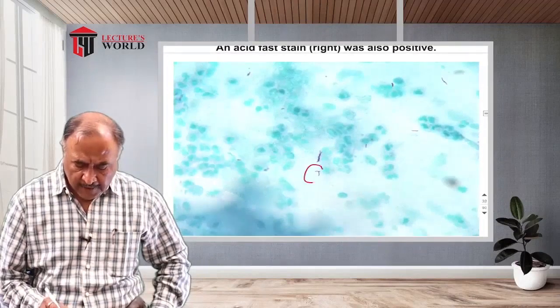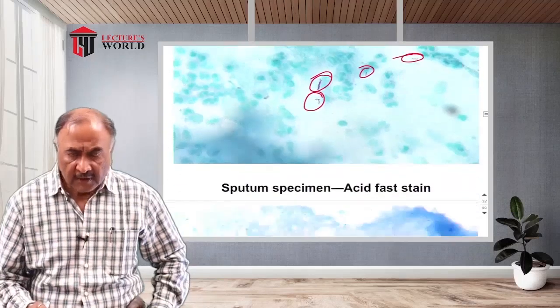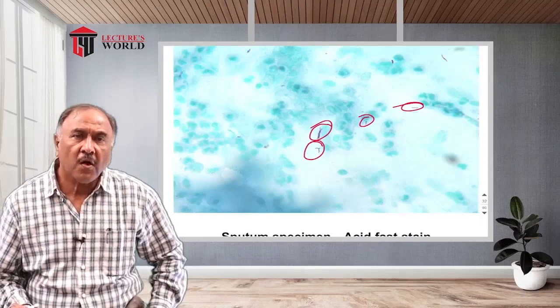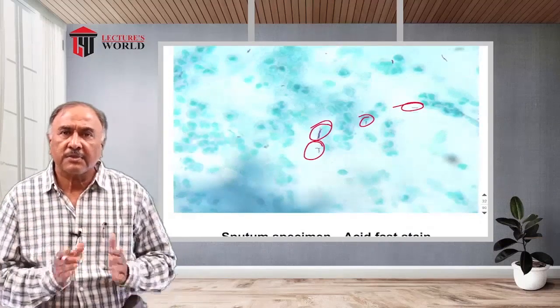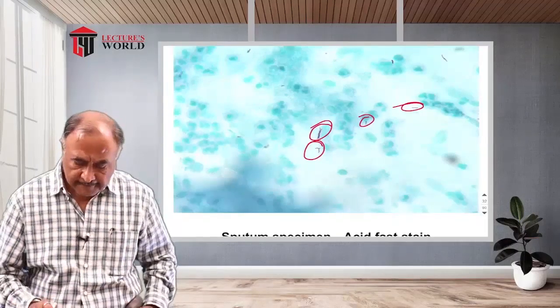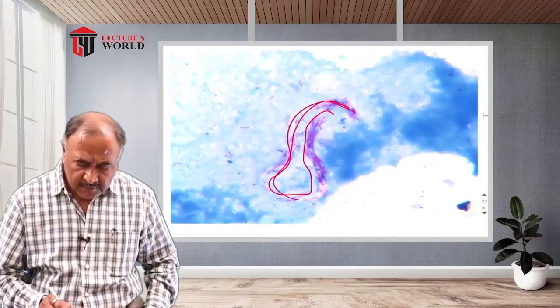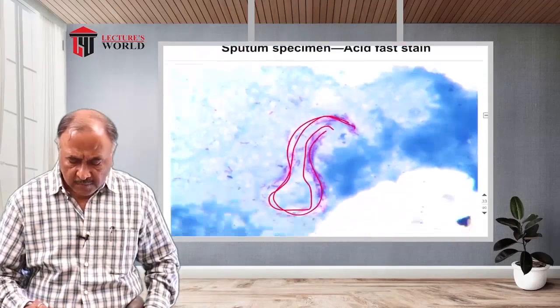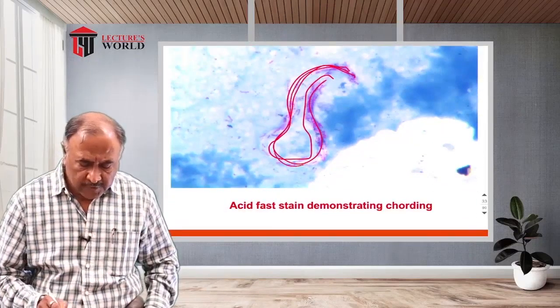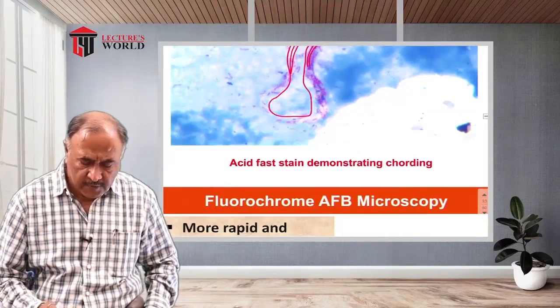You can see there is a typical arrangement and shape of the acid fast. They are thin cigarette shaped cells which can be arranged in V, Y or other shapes at different angles. This is the sputum sample showing the cording. Cording means cord-like structures like this. So this is the cording structure which is many times observed here.